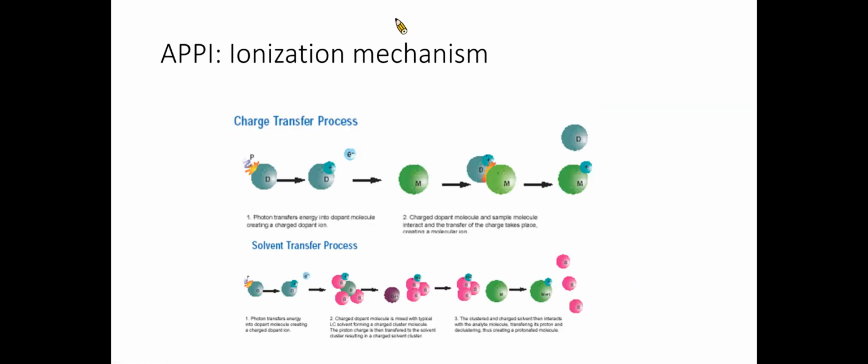Overall and in general, much of what happens in APPI bears close resemblance to APCI and CI, while the role of direct photoionization for analyte ion formation is less pronounced than suggested by its name.